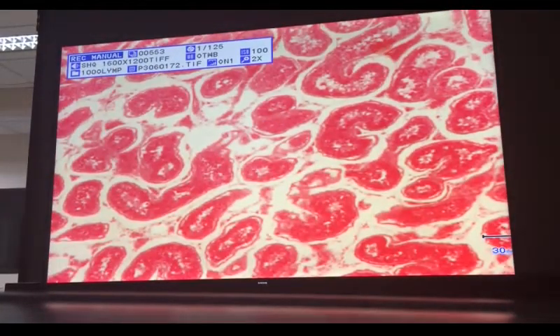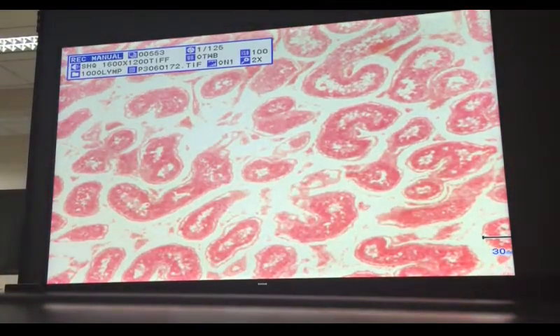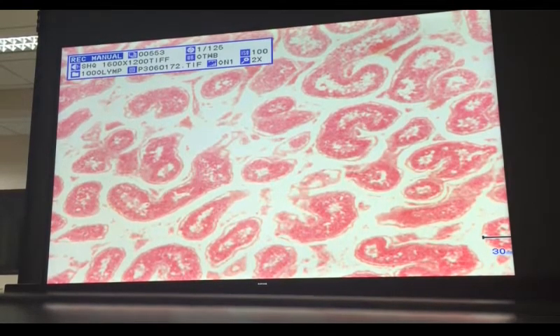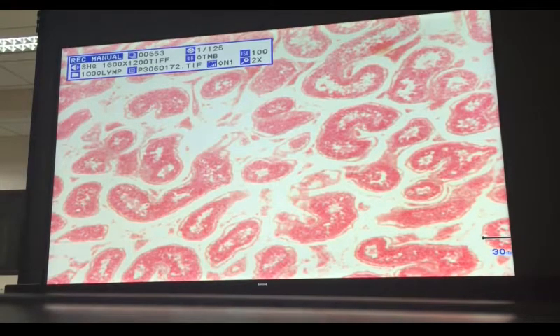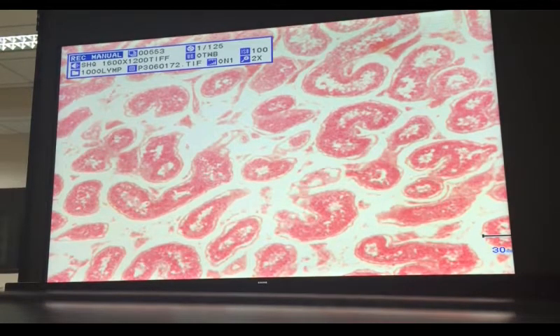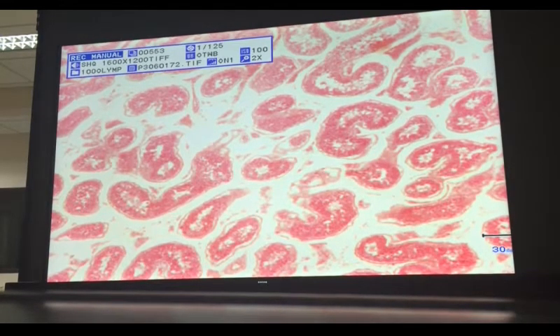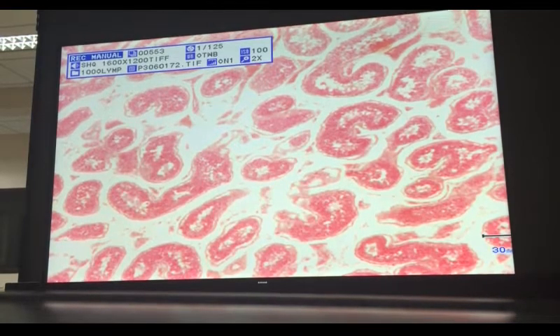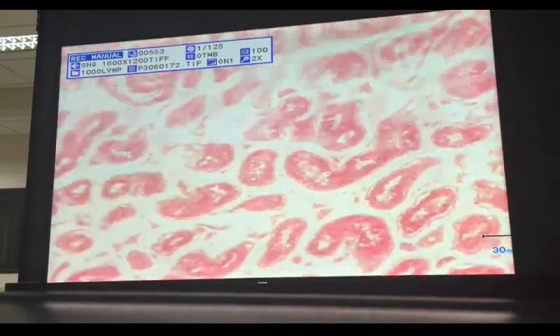And the seminiferous tubules are seen most of the time in the cross-sectional views. Actually, in reality, seminiferous tubules is a continuous tube which is highly coiled. So most of the time, we will not be able to see the longitudinal view of the tubules, but their cross-sectional view only. If we stretch out the seminiferous tubules, what is the length that is indicated in the book?